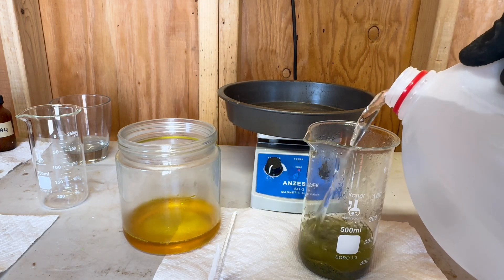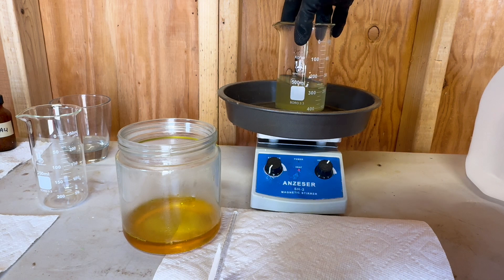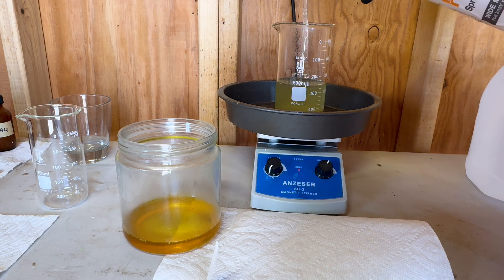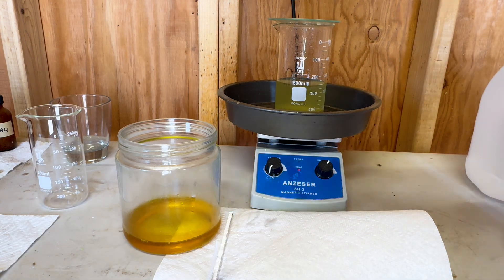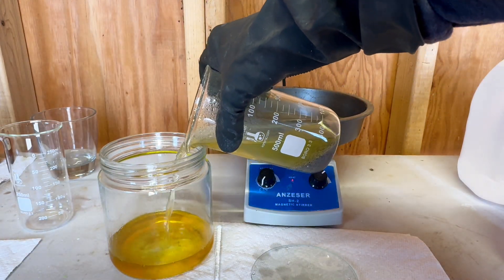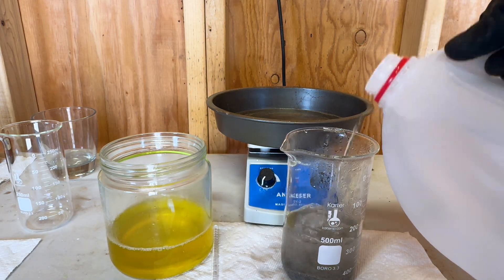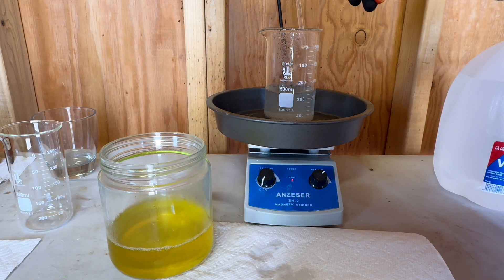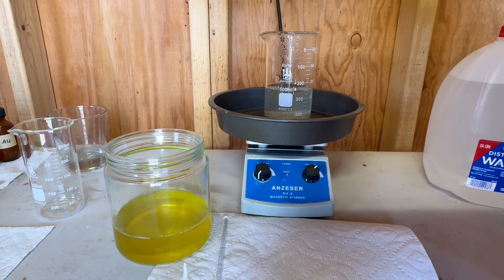Now we will give our concentrate three thorough rinses to remove all the hydrochloric acid that's in the concentrate. This is our second rinse. This is our third and final rinse.